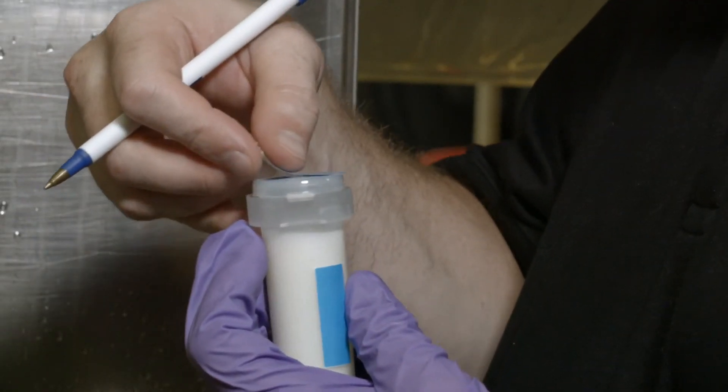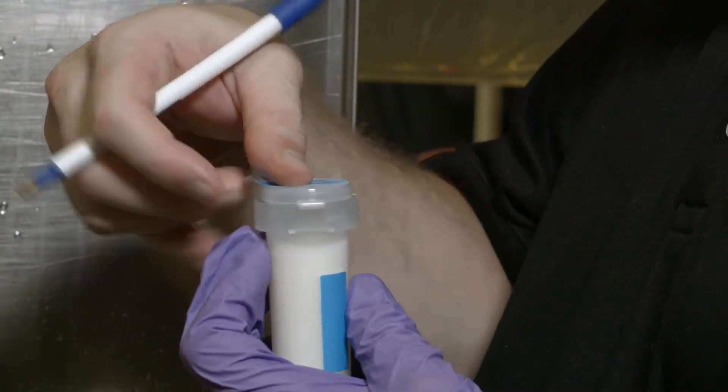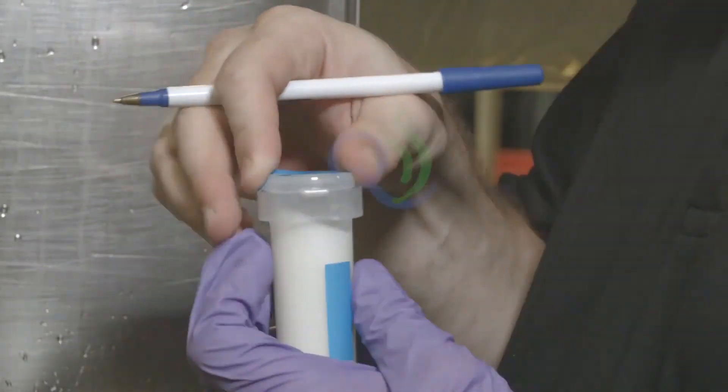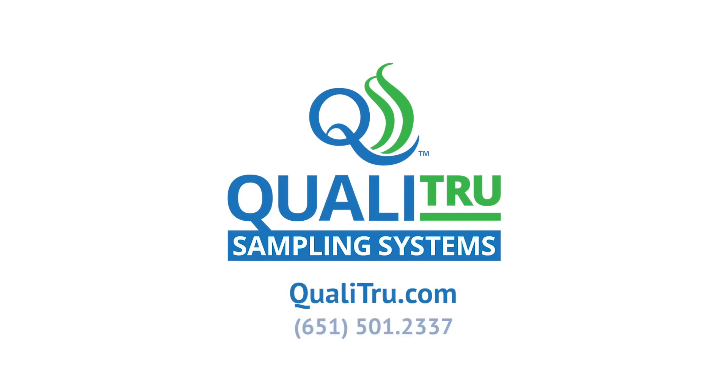If desired, you may add an identification label, which could include time and date for sample tracking.